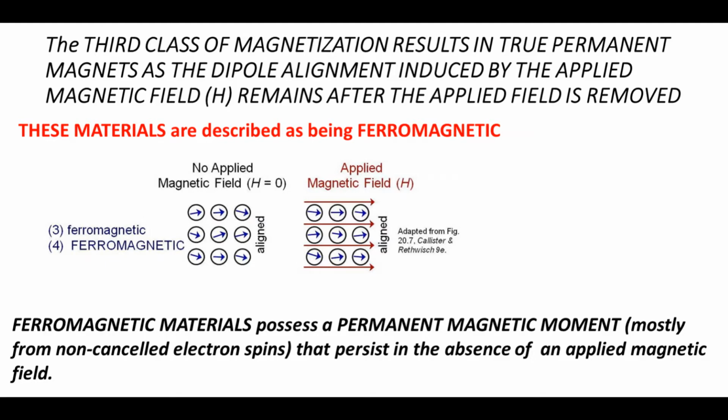Materials are only ferromagnetic below their corresponding Curie temperatures. Ferromagnetic materials are magnetic in the absence of an applied magnetic field. When a magnetic field is absent, the material has spontaneous magnetism, which is a result of the ordered magnetic moments. In other words, for ferromagnetism, the atoms are symmetrical and aligned in the same direction, creating a permanent magnetic field.